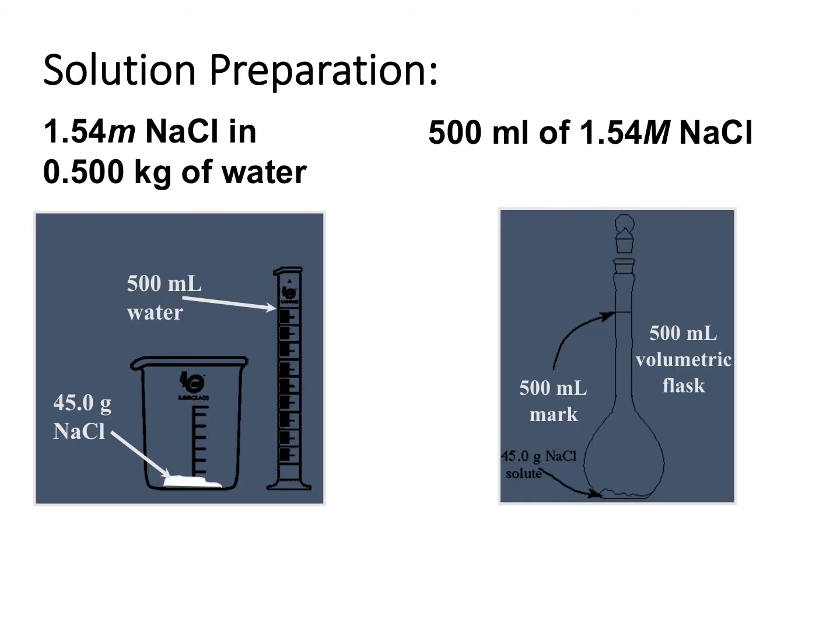So the preparation procedures that we're going to be using to make solutions are going to vary depending on if we are preparing a molal or a molarity solution. So we're going to start by talking about the molarity solution and its steps, and then we'll talk about the molal solution. So step one is going to be to obtain the equipment that you need.